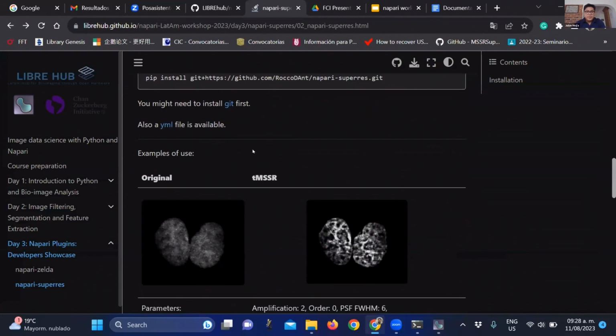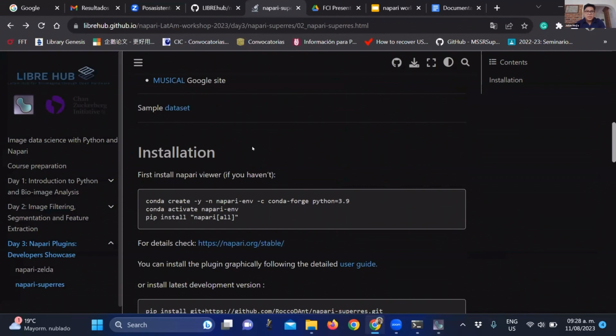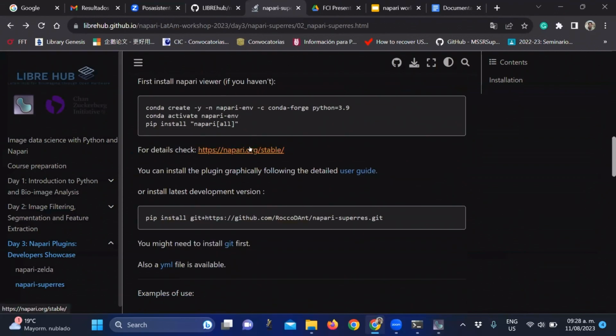And yeah, so the manual, I put it. User guide, if I can suggest, you showed before. Yeah, here. Yeah, thanks. I just mentioned it because it contains also the instructions to use it as a guide to do the graphical installation, but it contains everything. So please use it as much as you need.